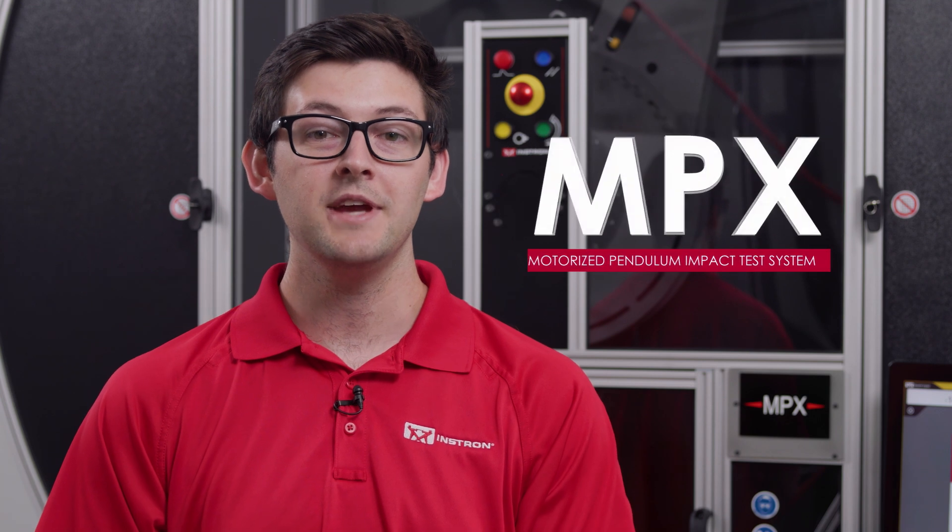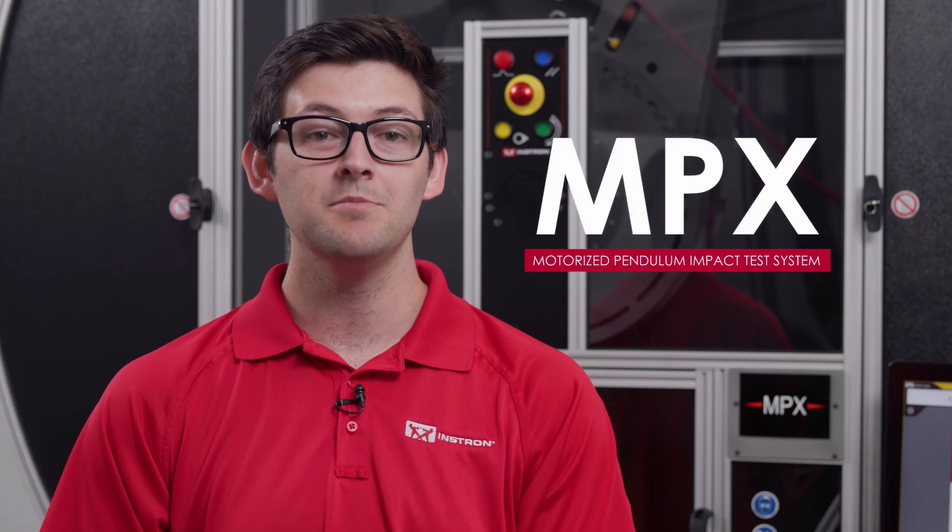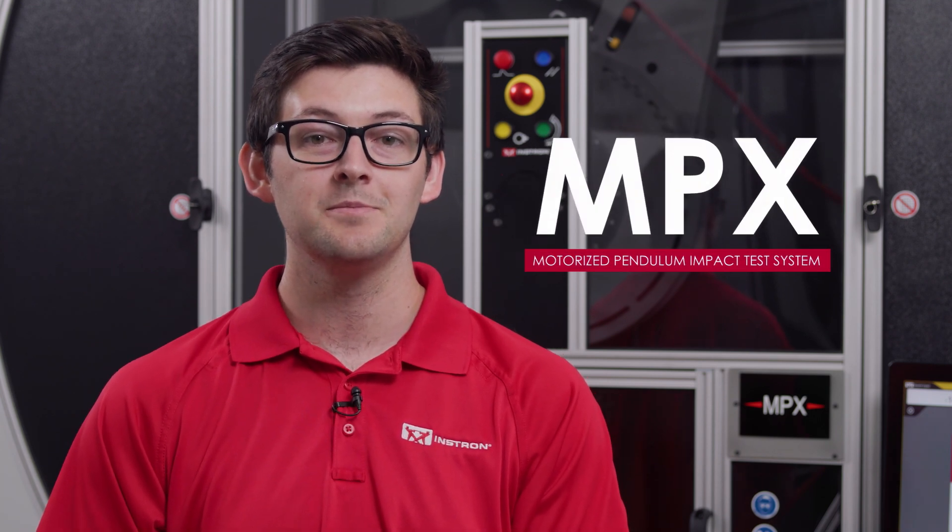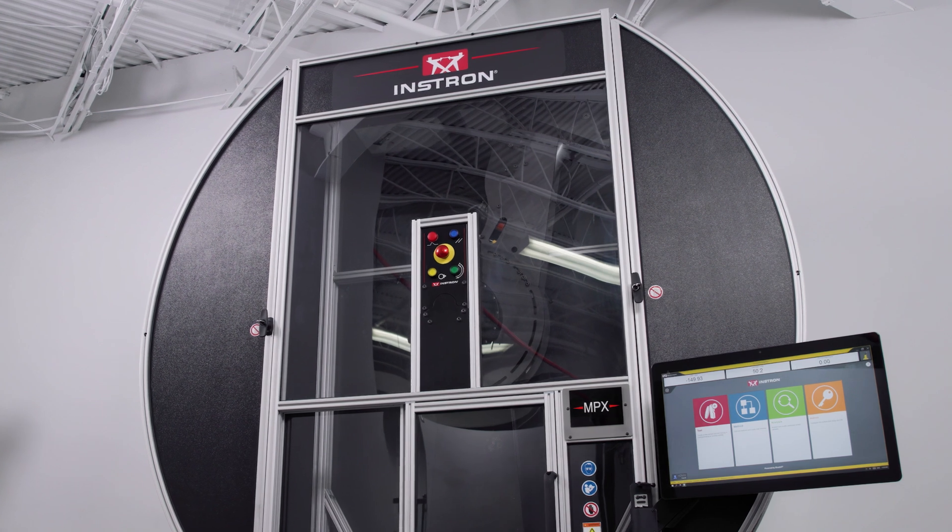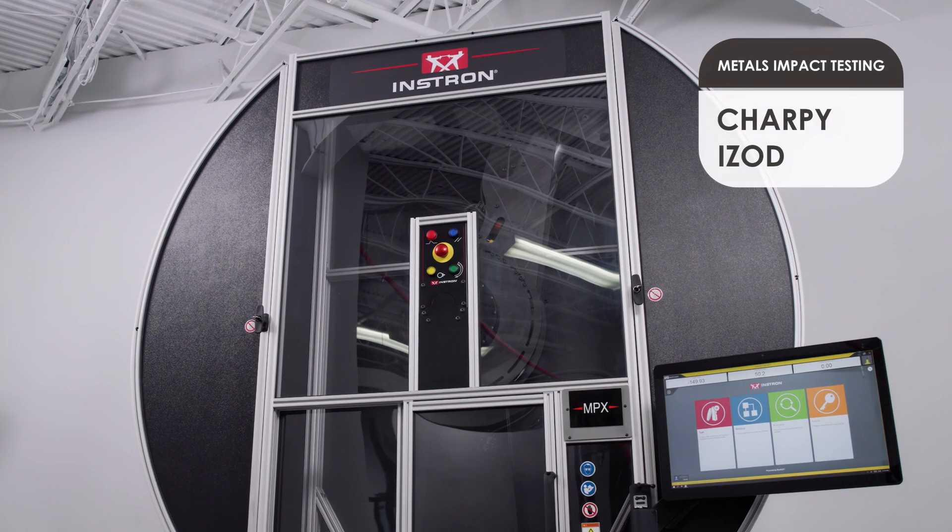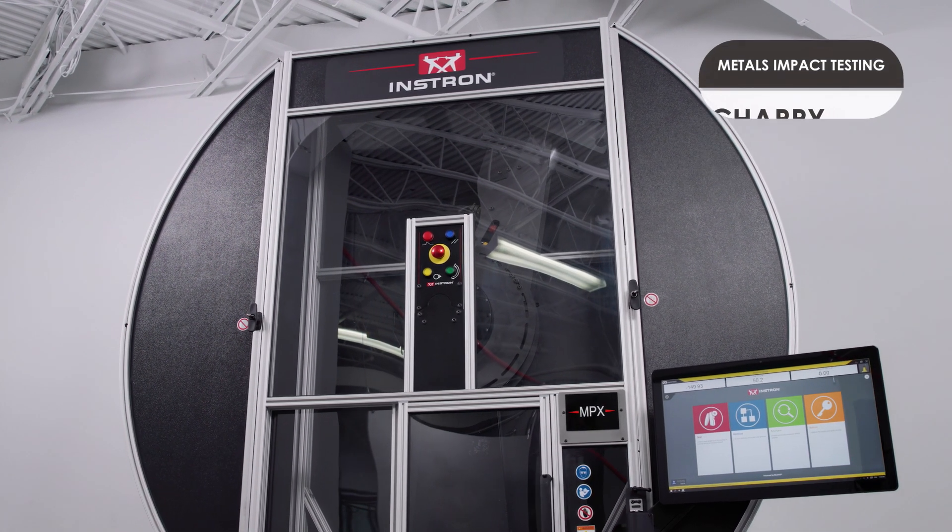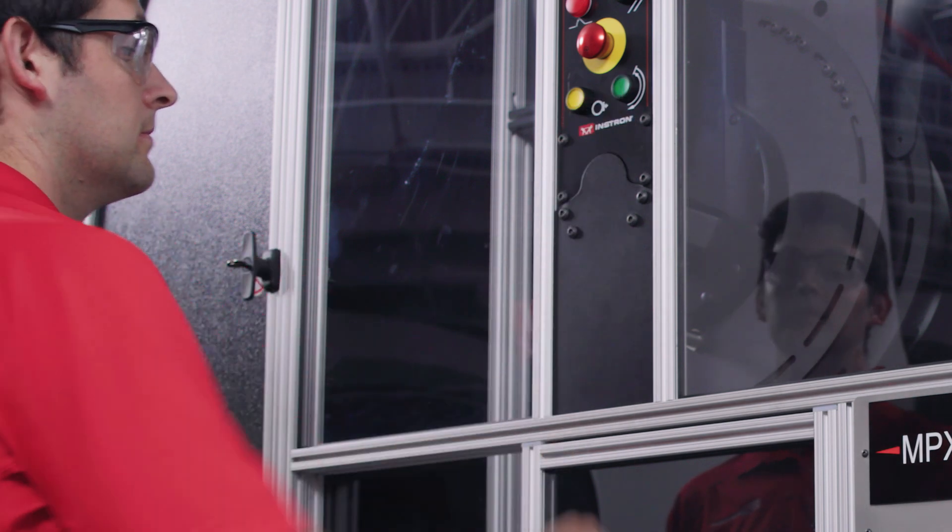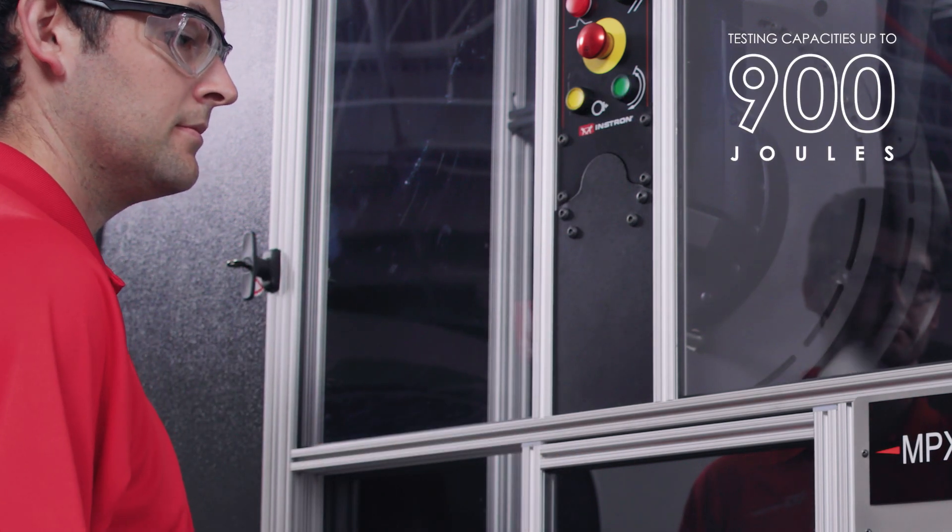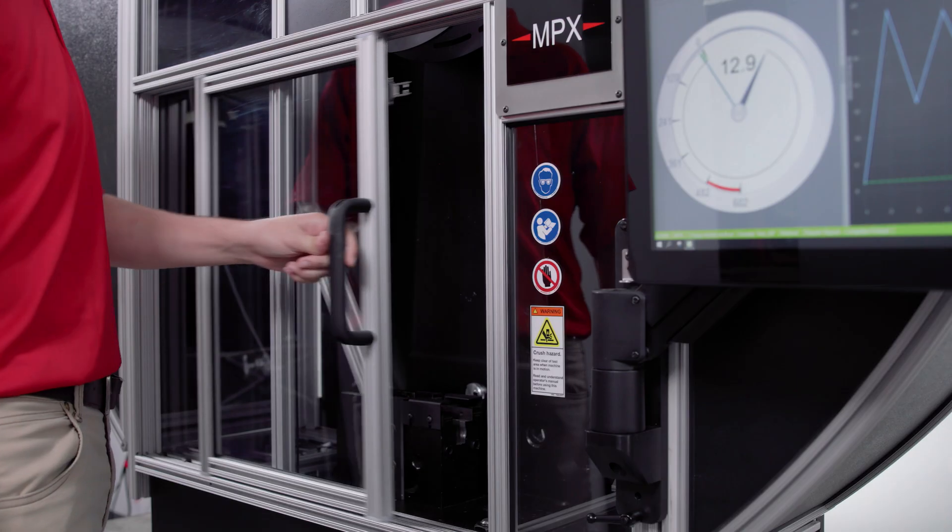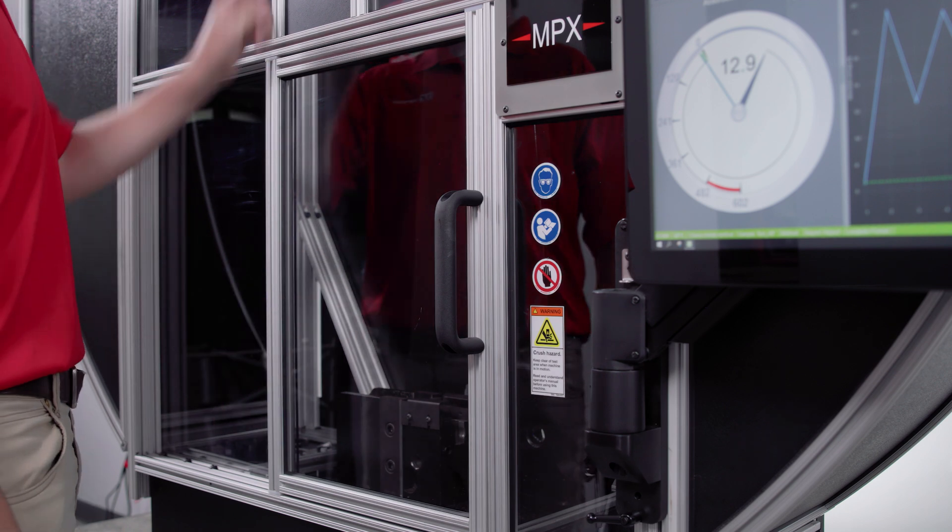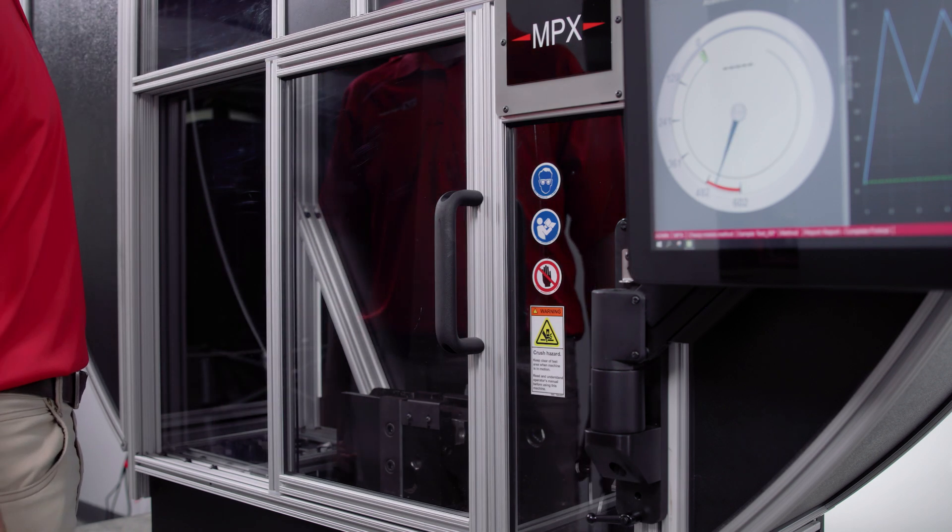In this video, I'll be providing an overview of the MPX, our fully enclosed and motorized pendulum impact testing system. The MPX is commonly used for metals impact testing to Charpy and IZOD standards and can be configured with different hammers that offer a range of testing capacities up to 900 joules, delivering a high degree of precision and accuracy for high and low energy testing.